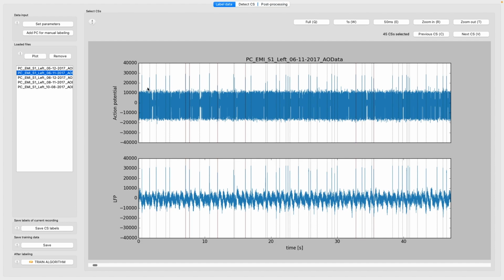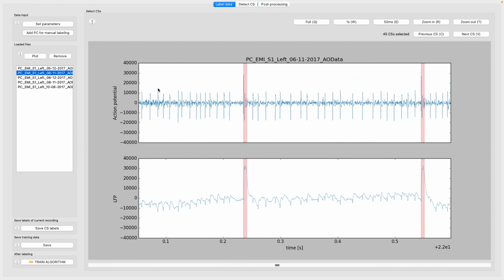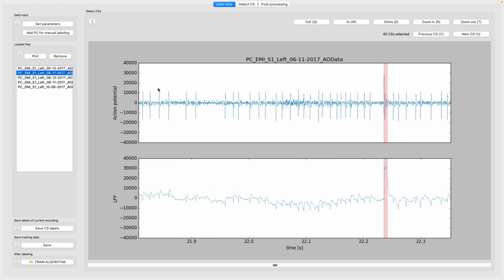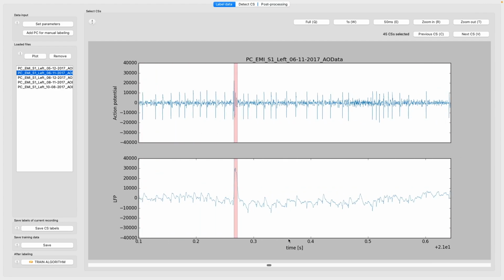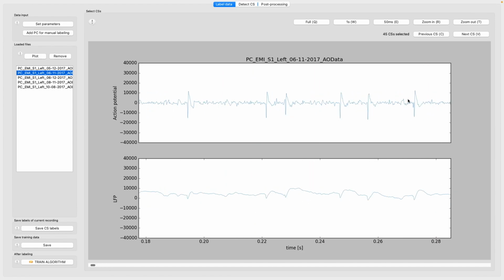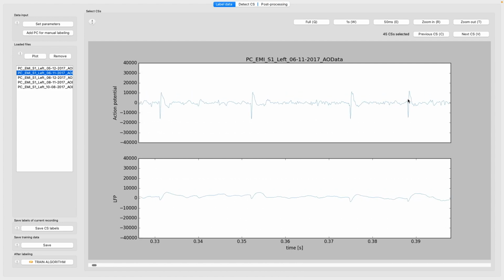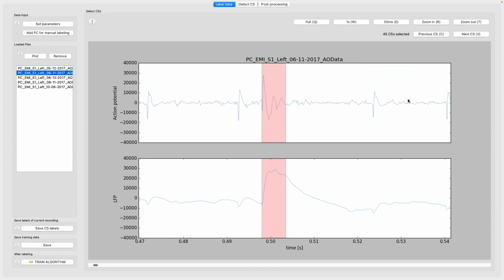Now if you zoom in again with the button R, let's go here and go back with D. If you want to go forward, press F, and you can keep going forward and backward. Let's go to the very beginning of our data set, so scroll back to the first sample. Then I press R, zoom in, and go forward until my first complex spike appears. This is going to take some time. There you go. Cool. So what you see is that this is a selected complex spike.